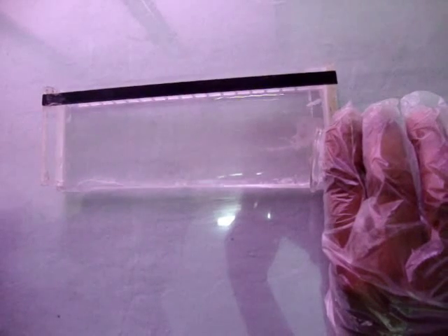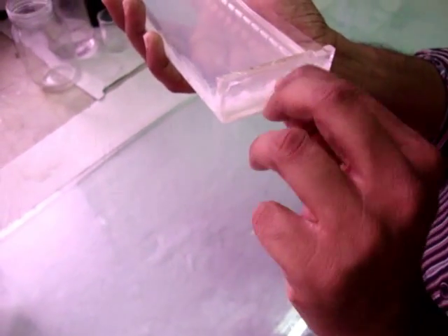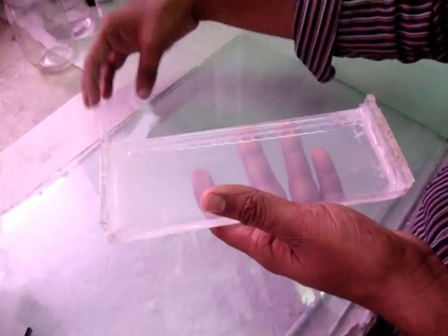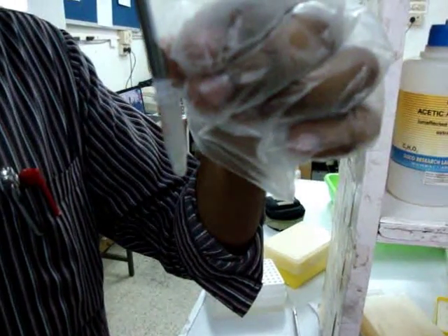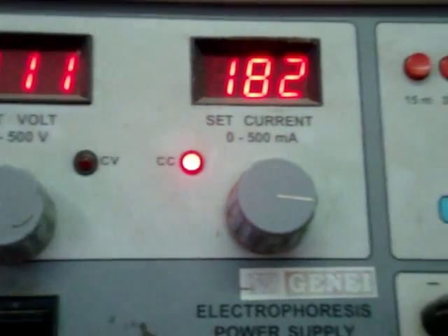Agarose gel is poured into the gel-casting tray. After solidification, the comb is removed and the cello-tapes are removed carefully. The gel is placed in the chamber containing 1X TBE buffer. DNA samples are mixed well with 5 µL of loading dye, then the DNA samples are loaded into the wells. The gel is run at 110 volts for 2.5 hours.